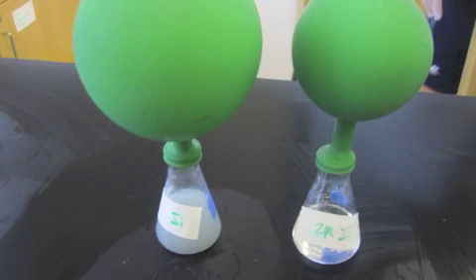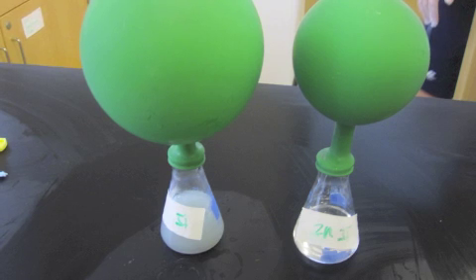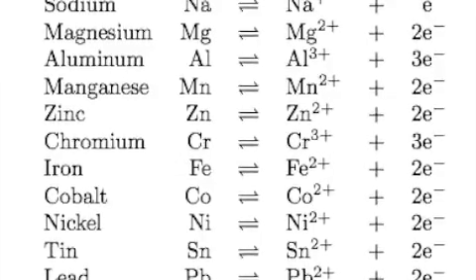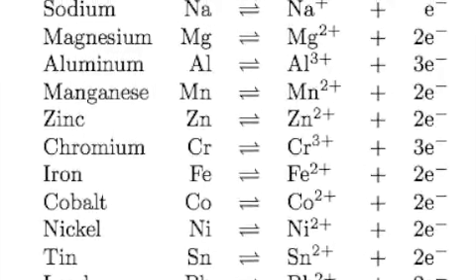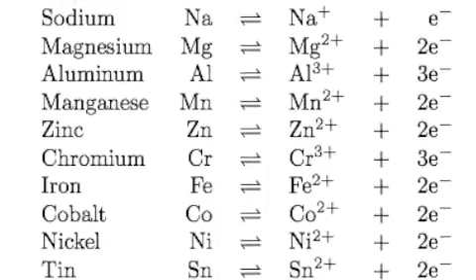The main purpose of this lab was to find out which of the metals was the least corrosive when put in H2SO4. It was expected that the metals that were placed higher on the activity series would corrode the most, as they are more reactive.